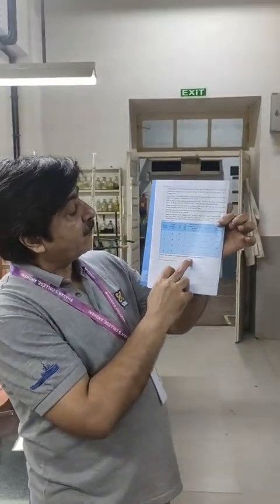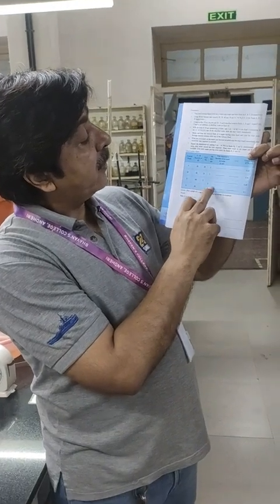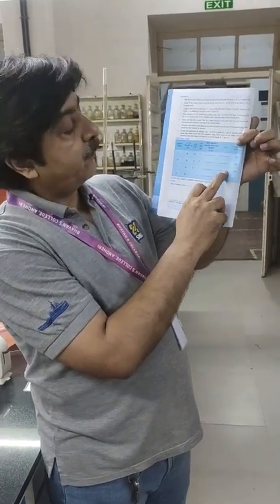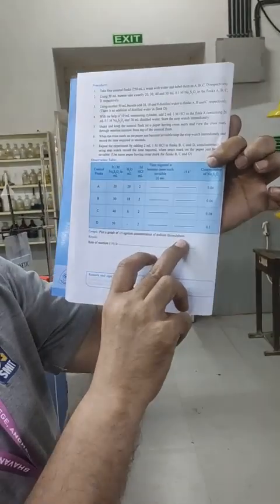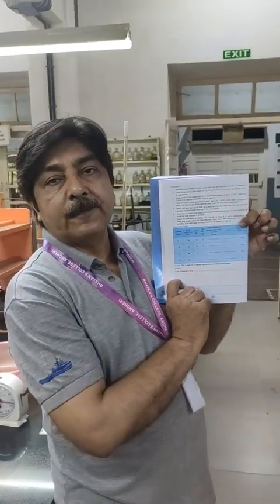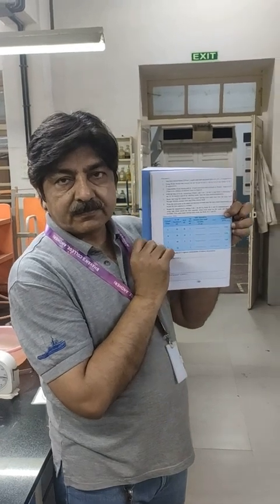Now, the time which was recorded for all these 4 readings will be converted in terms of seconds, and then we will find out 1 by t, 1 upon time in seconds. And finally, we will be plotting a graph of 1 by t against concentration of sodium thiosulfate solution. And from the nature of the graph, we will predict the order of this reaction.